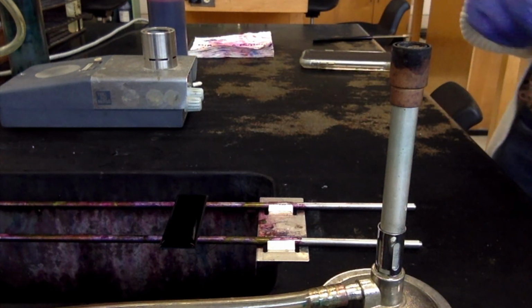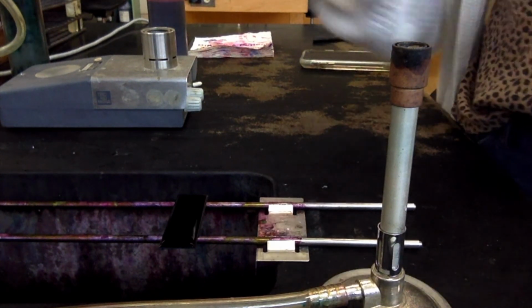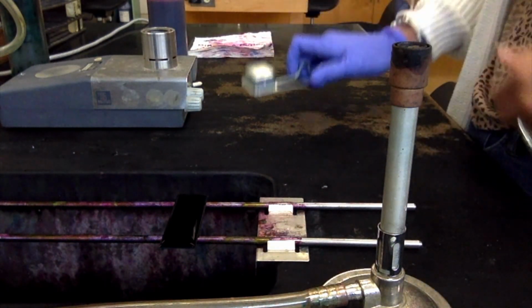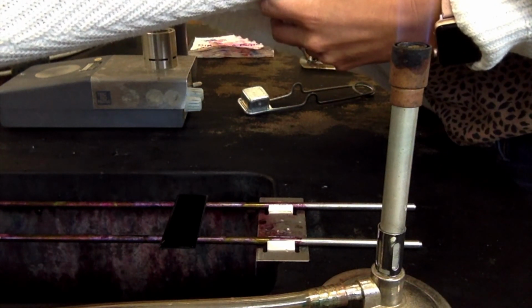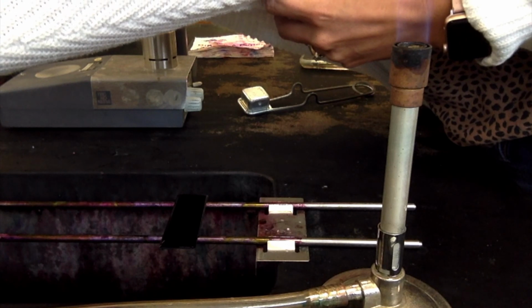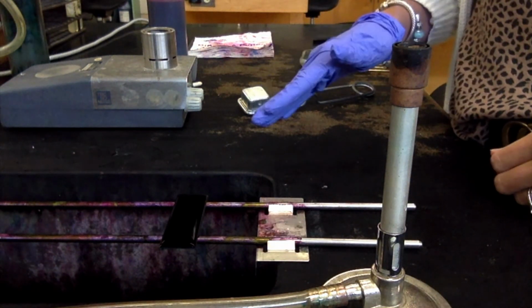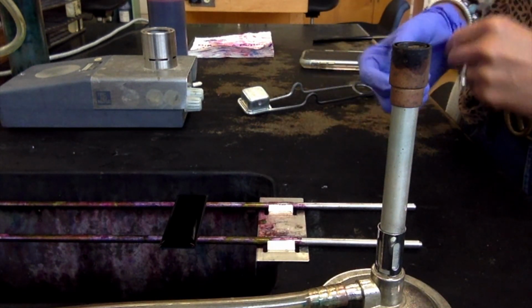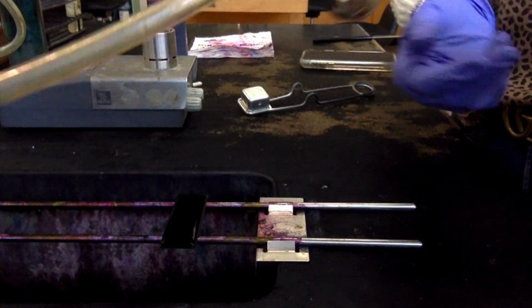So I'm going to light my Bunsen burner, turn my gas on, light my Bunsen burner. Now, I want to turn down the gas a little bit because I don't want that fire to kick back up on my hand and burn me. So I'm going to do that. And of course, I'm not going to pick this up with the hand that I have the glove on, because we don't want to touch anything hot while we're wearing the glove. So I'm going to pick it up on the bottom, and I'm going to turn it over.